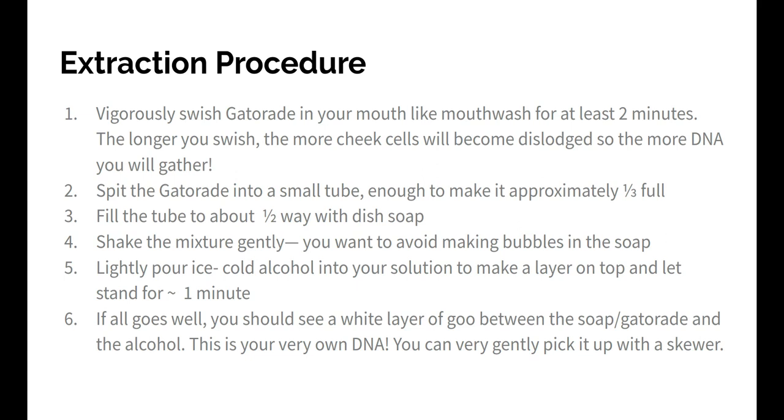If all goes well, you should see a white layer of goo between the soap and the Gatorade and the alcohol, and that's your own DNA. You can gently pick it up with a glass skewer. As I said, it's a little bit delicate, but if you pull it out into the air, it'll immediately start to coagulate, and it looks a lot like mucus, which is interesting.